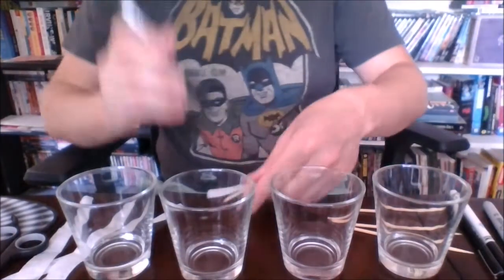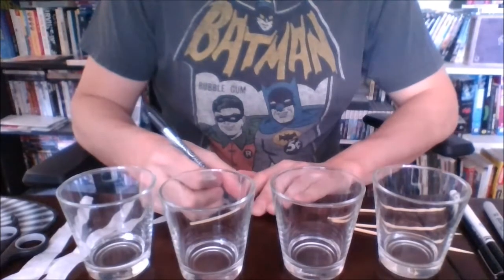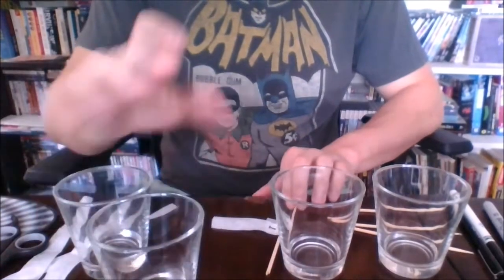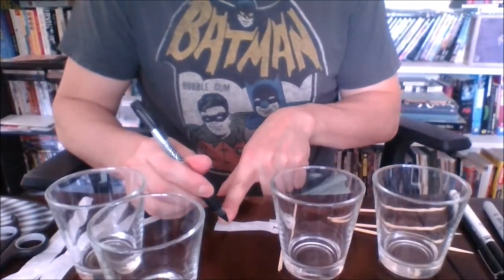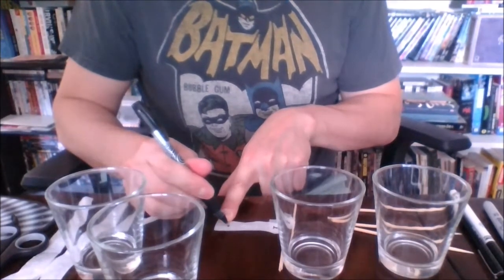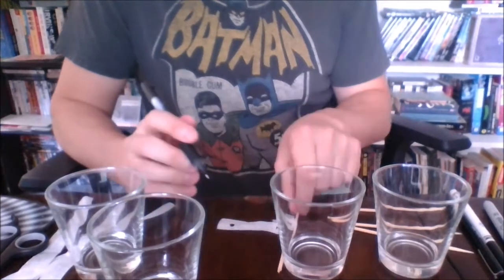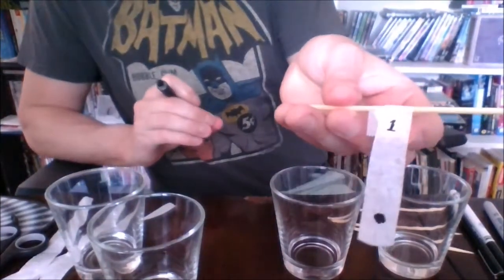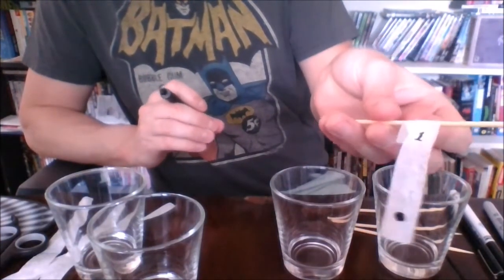So this gel pen will be sample 1. Going to write sample 1 at the top, or just the number 1. And then about 1 centimeter up, which is about a fingernail, about a thumbnail for your size, I'm going to draw a dot on the paper. Now you'll see, because I'm using filter paper here, it actually soaks through very dramatically. It goes right through the paper and it really saturates it.